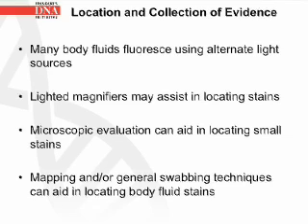Many body fluids fluoresce under alternate light sources. Lighted magnifiers may assist in locating stains. Microscopic evaluation can aid in locating small stains. Mapping and/or general swabbing techniques can aid in locating body fluid stains.